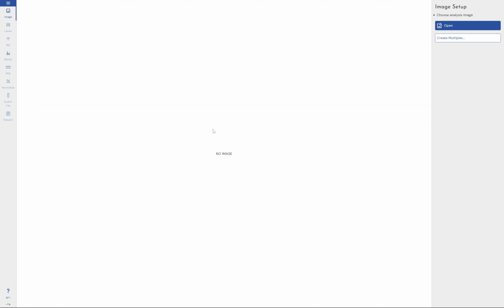It's compatible with Windows, Mac, and Linux. It's fully supported up to the latest version of Mac OS. I think that's Big Sur. Worked on M1, M2, M3, M4 silicon from Apple and is tested on Windows 11. And of course comes in a 21 CFR and GMP compliant version for use in the pharmaceutical industry. Now, I'm not going to be going through that. I'm just going to be showing you the stock version here, which is what you would use in a regulated environment with an additional layer on top, but the underlying software is still the same.